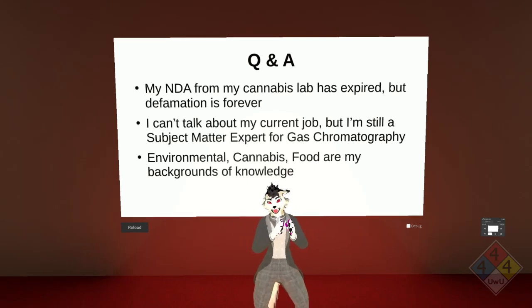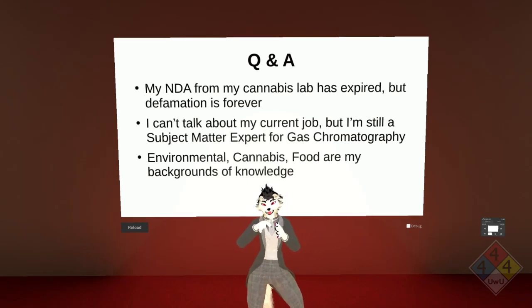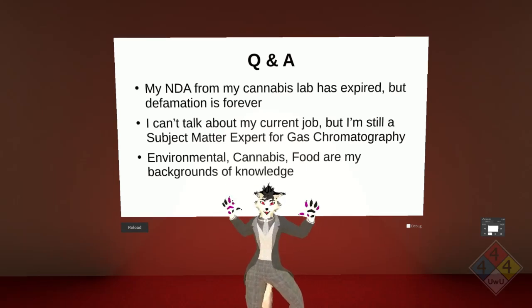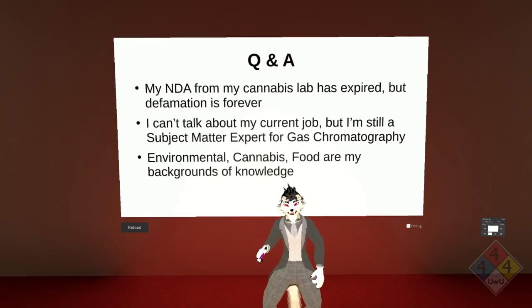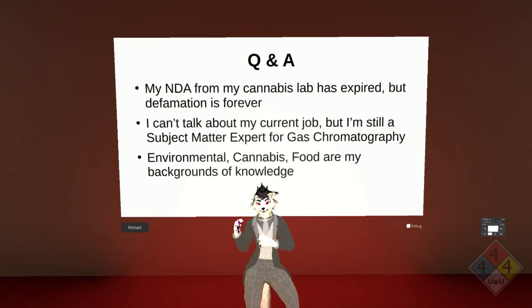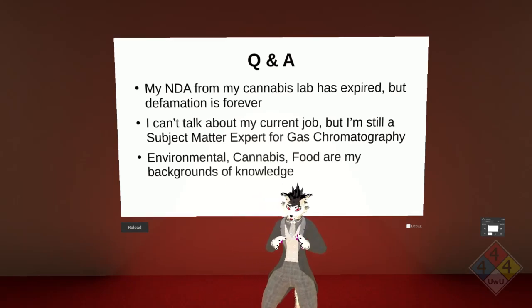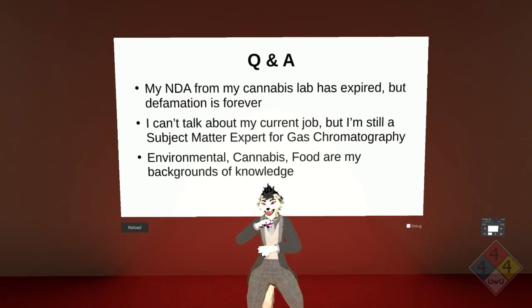At mild ionization, you may not do a lot, like you get a single proton. Hard ionization is the ICP, where you're just ripping the molecule apart. You just tear it apart, and you're giving it a charge from the plasma. So you can't do everything on one instrument as one would hope. These things do have to be pre-built and targeting your zone, your analytes of interest, which includes sensitivity.